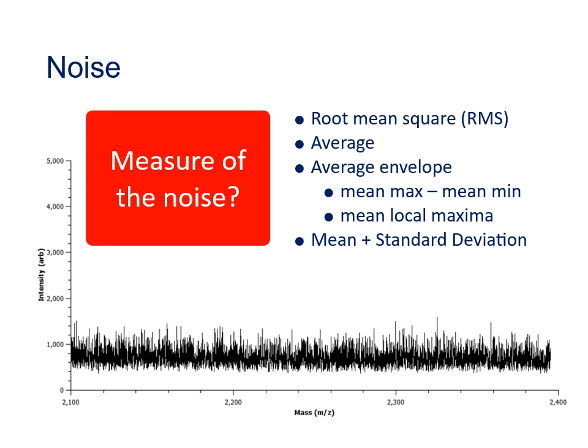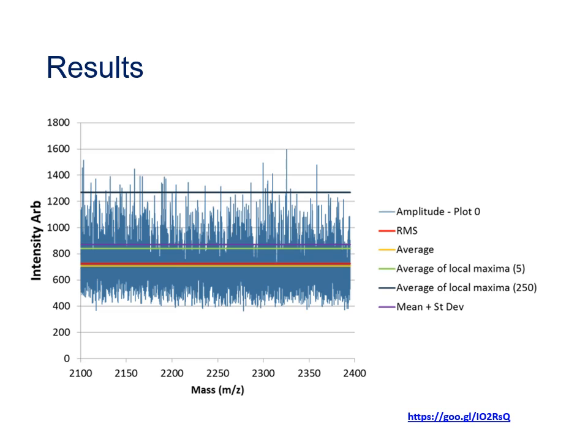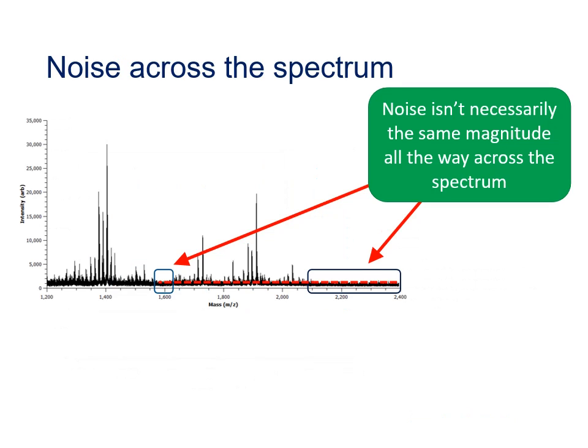One of the tasks that we will undertake in the session will be to take this specific noise region and calculate some of these different measures of noise. That way we can begin to understand what the differences between them really are. But because it's important to discuss, here's a spoiler alert. If you calculate the noise levels by all these different methods, you actually get very different results. And the noise level also isn't necessarily constant across a spectrum. So how do you interpret a noise level?